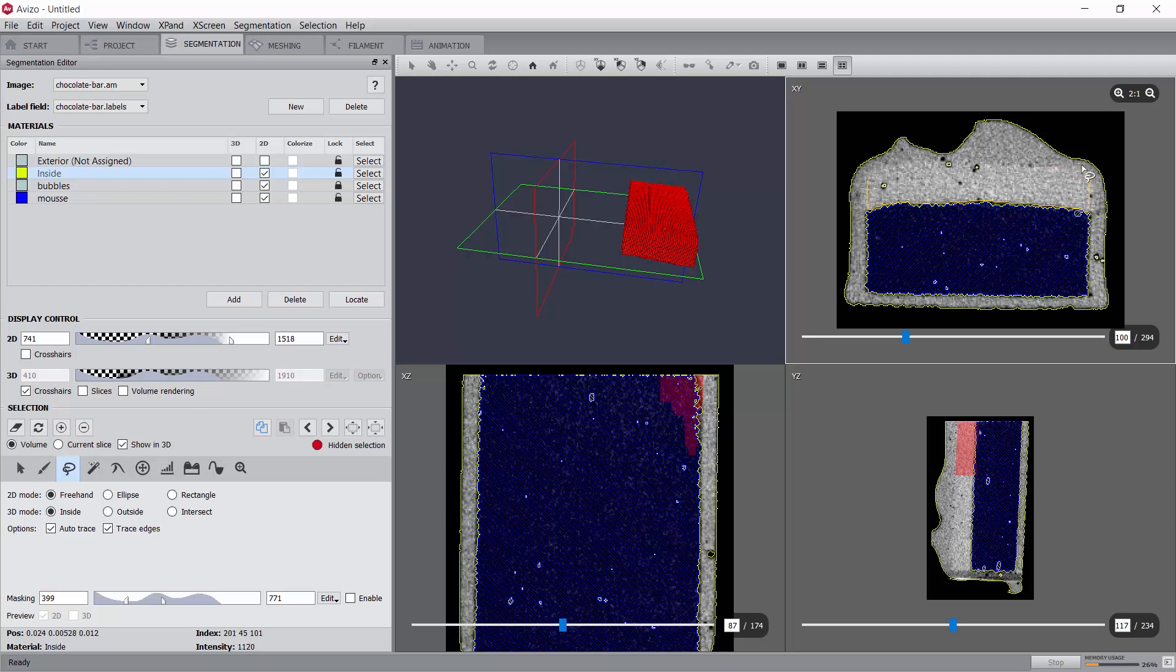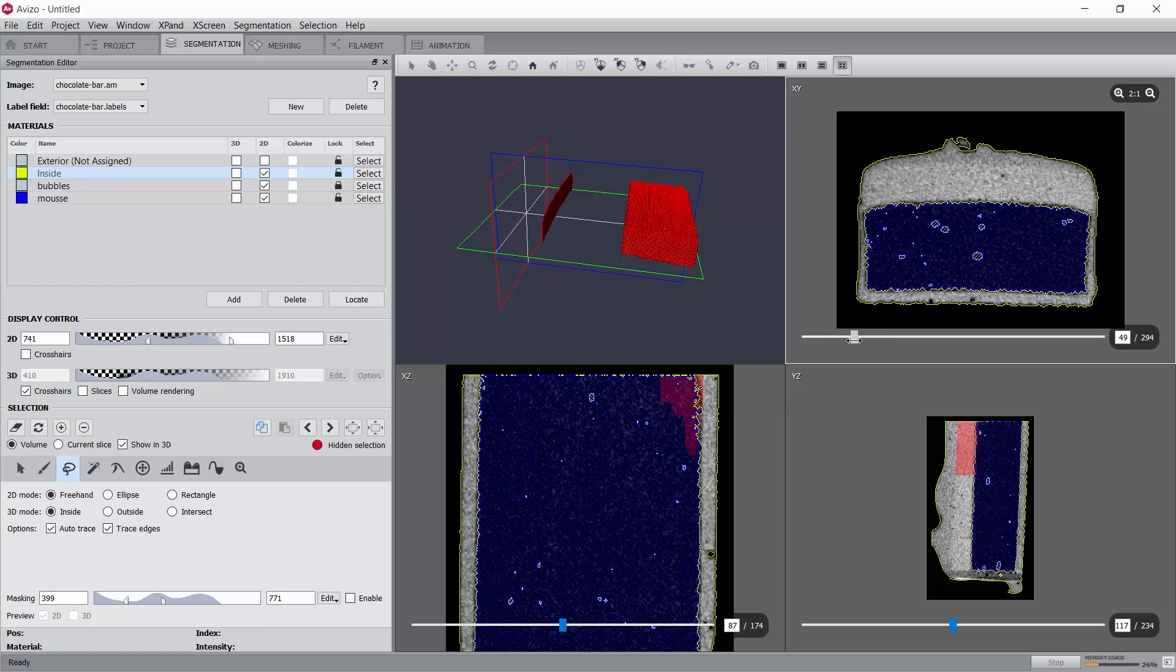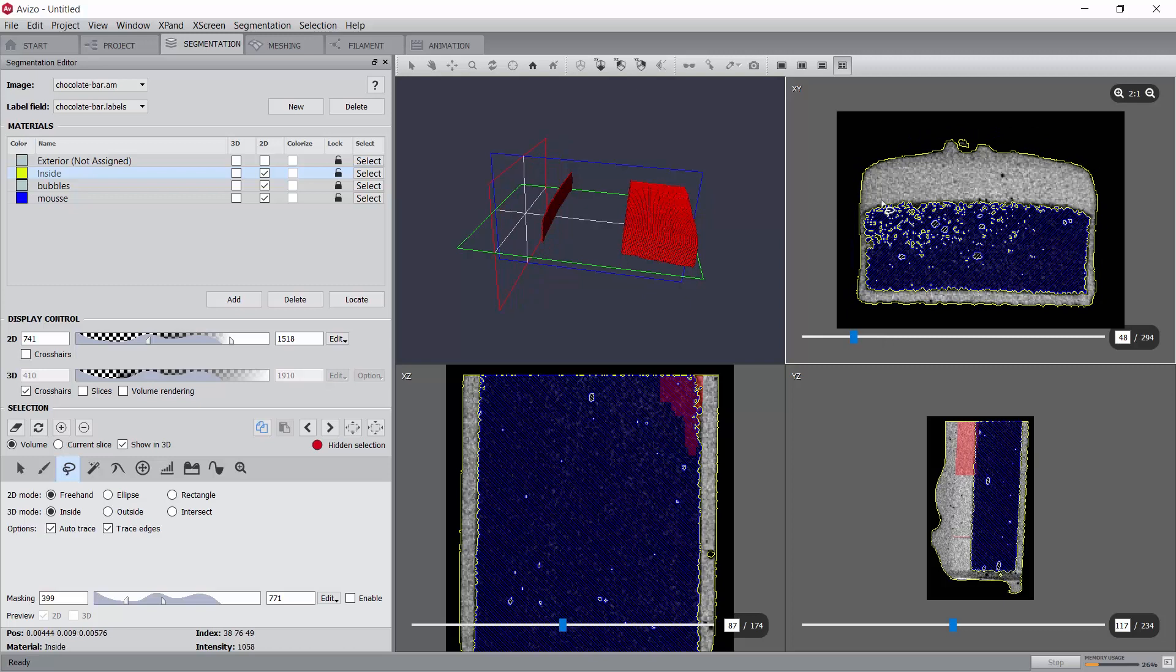For example, we can continue with the lasso tool in auto-trace mode to process slice 100, and maybe the last slice. As long as only 2D parallel selections are being made, the interpolation will fill in the gaps between consecutive planes.